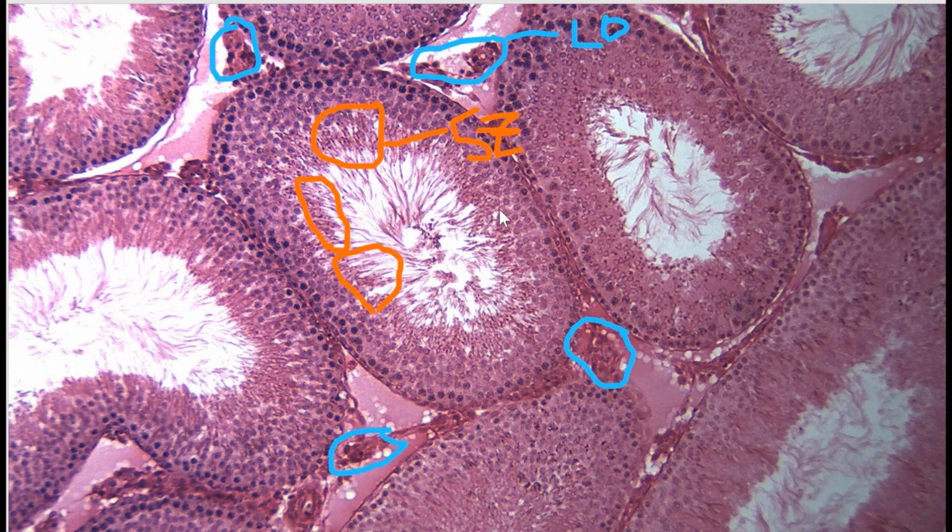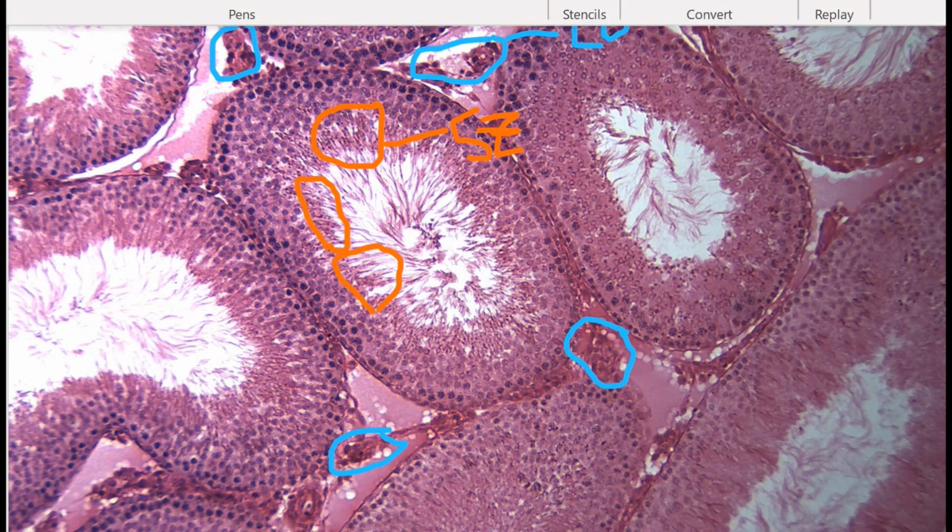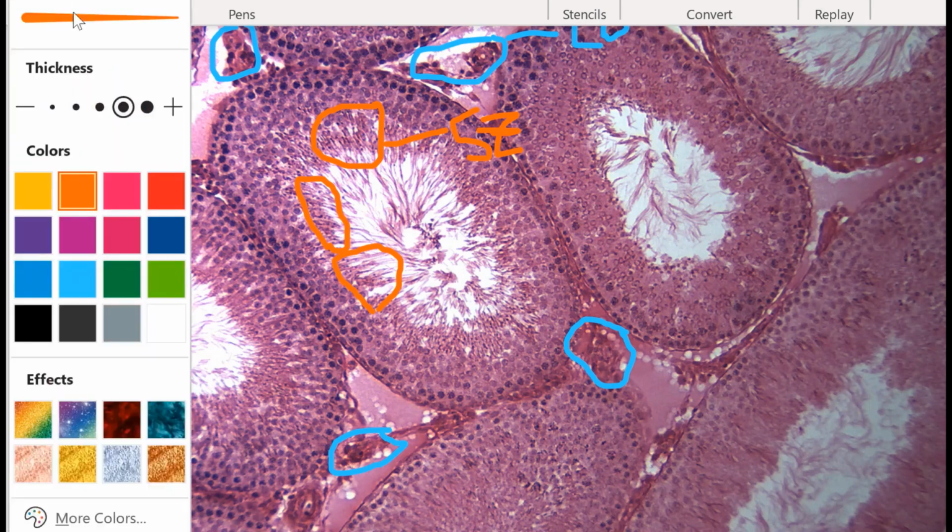Okay. What's cool is you can see the heads of the sperm here and then their tails. So these are all baby sperms that haven't got their tails yet. And then as they become spermatozoa, they get their tails, right? So they're working towards being adults in the sperm world. I wonder what it's like to be in the sperm world. Probably not that cool. Okay.